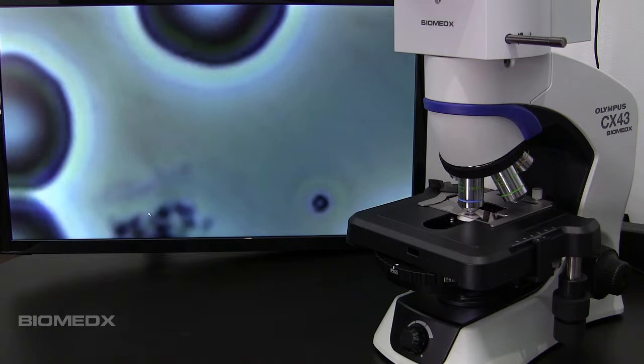You are going to get a good idea here in a second. There it is. It was in the process of flipping and I froze the frame. From here you could actually measure this if you wanted to. The camera has internal software so you could put up grid lines and measurement lines, presetting those with a calibration slide. The system also comes with computer software which is driven by the camera so you could get a little more fancy if you wanted to go in that direction.